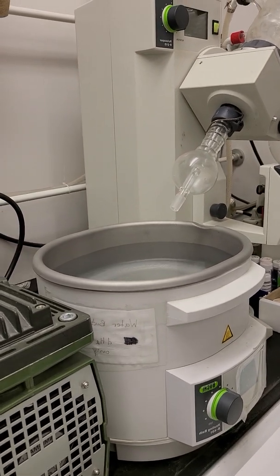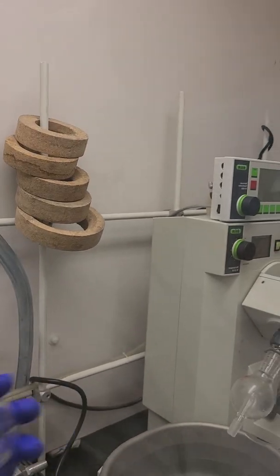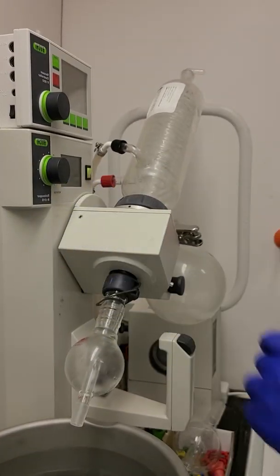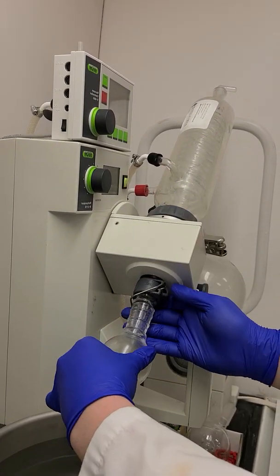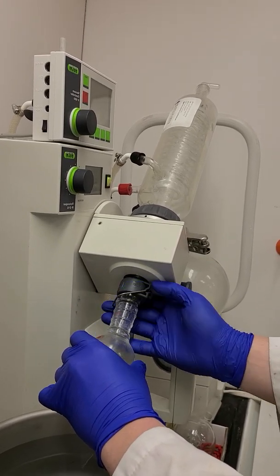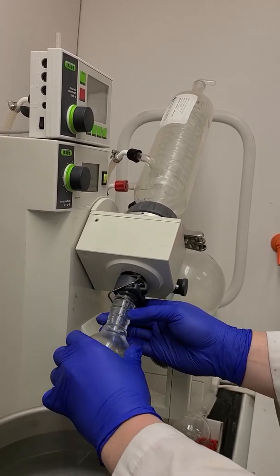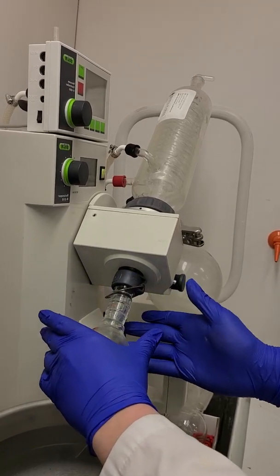Okay, the next step is to attach your round bottom flask. So this part here is connected via this spring, and this can be removed. This here is the clip that holds it in. As you can see, it's slightly broken, so be very careful. But since it's not broken on this side, you can actually hold it in like this.